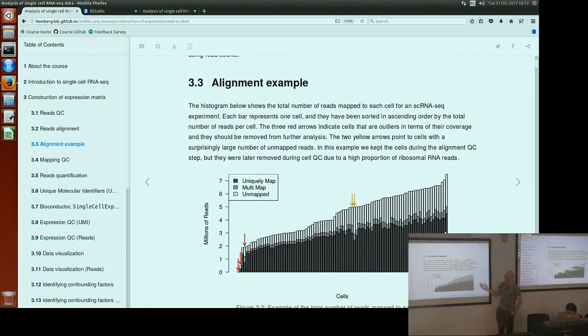So the question here is, is this the reason why we have differences here? Is that because of cell size differences, or is it because of amplification biases? I think in this case, do we know the answer to that? In this case, we believe it is amplification noise, because these particular cells we expect to all be approximately the same size, but cell size will also usually cause a bigger skew than is seen here.